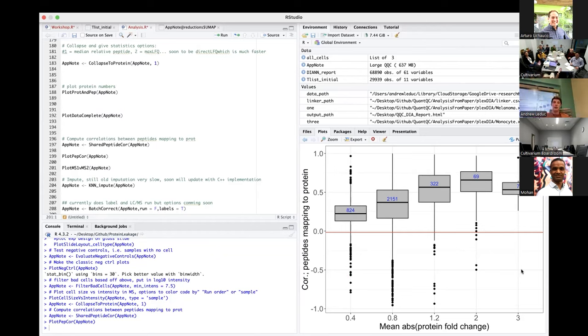And if you have two peptides from that protein, they're both going to be high, then both low, then both high across these different single cell types. And if that protein is really variable, the correlation should be much stronger because you have a lot of signal, so it should be easy to get a good correlation essentially.